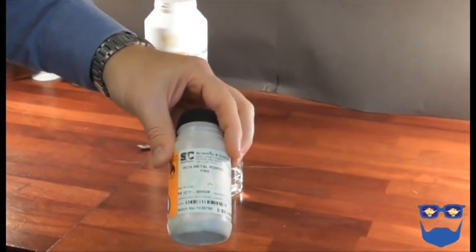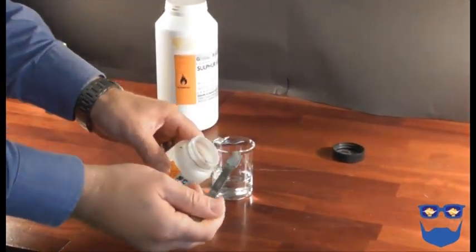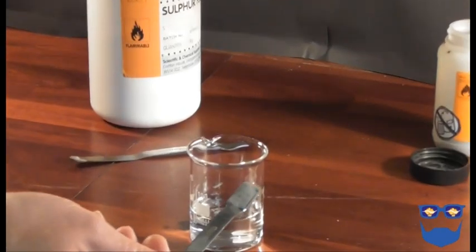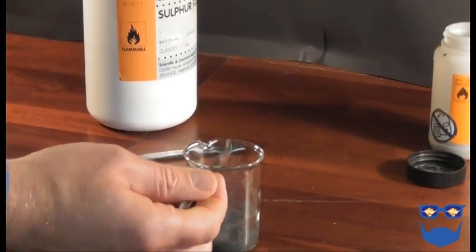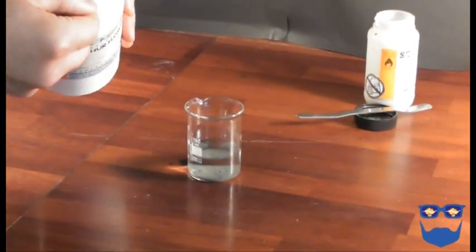Testing the physical properties. I'd ask the students to add one spatula, a small spatula of iron powder to a beaker of water and record their observations. Then add a similar amount of sulfur powder and record their observations once again.